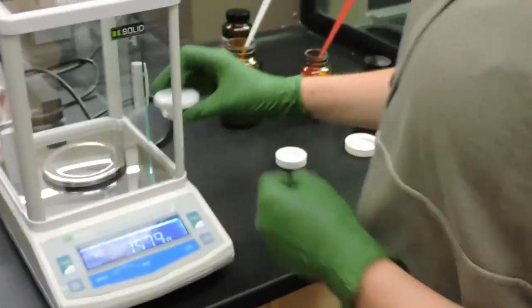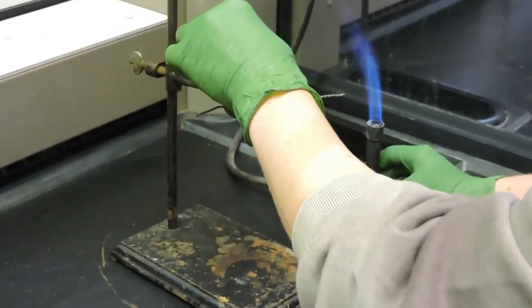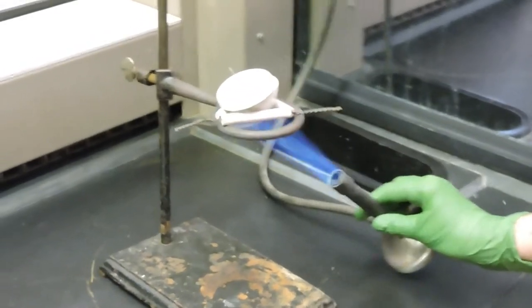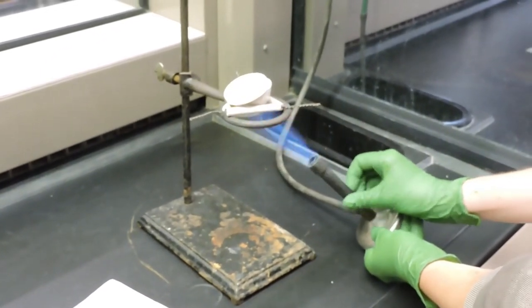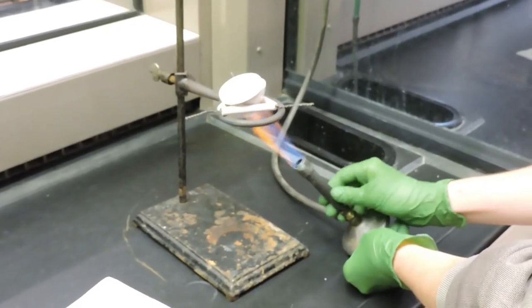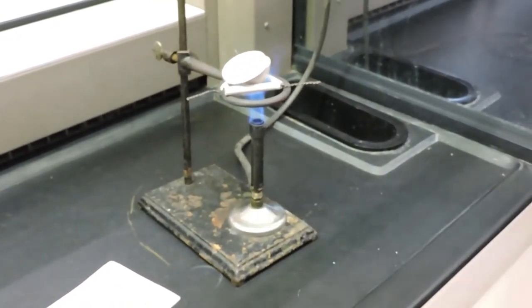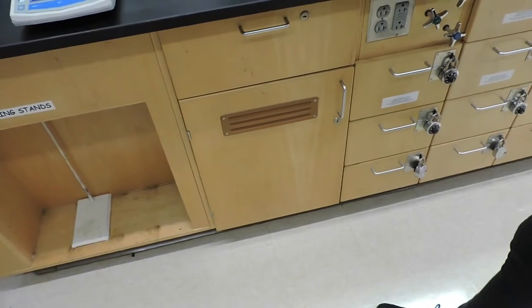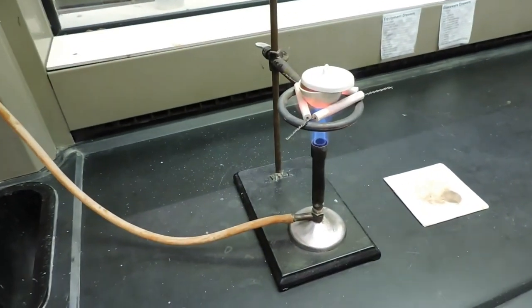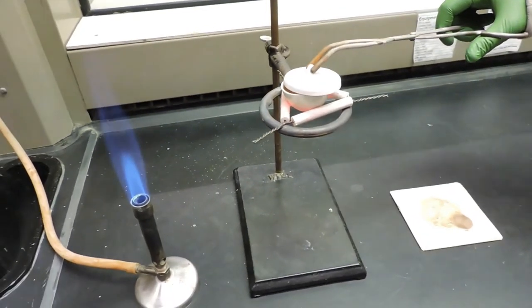And much like the crucible with the copper sulfate pentahydrate, we'll take our unknown hydrate in the crucible, set it onto a clay triangle, and gently heat for just a couple minutes before moving to a more intense flame and heating intensely for 10 minutes. Now that the crucible containing the copper sulfate pentahydrate has been intensely heated for 10 minutes, we'll remove the flame from the crucible and allow it to cool to pretty much room temperature.